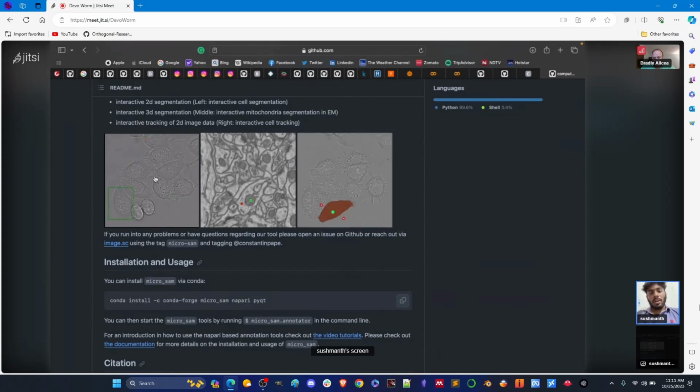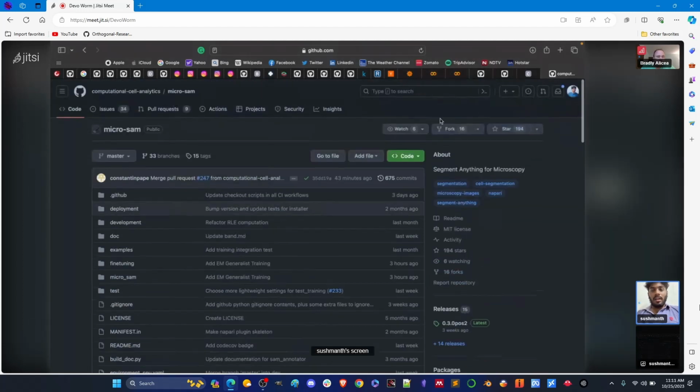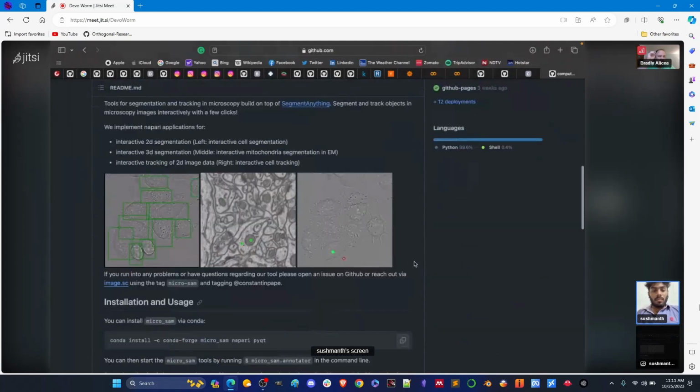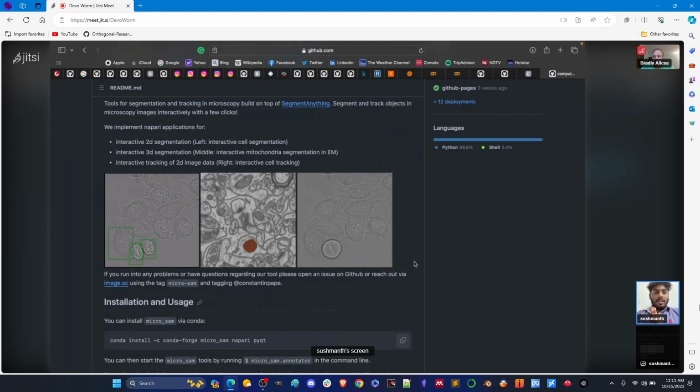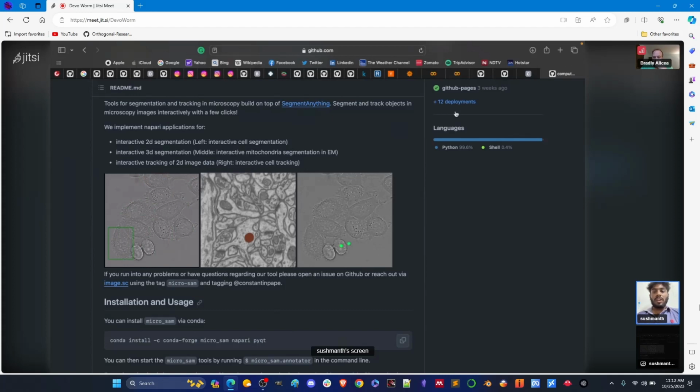By giving the bounding box prompts, it will segment it properly. Okay, and you just use either a point or a box as the prompt. Exactly. These are all live microscopy images, which are fed from an electron microscopy. So this is what I have done, Bradley.